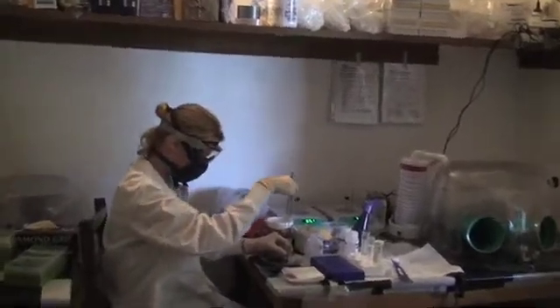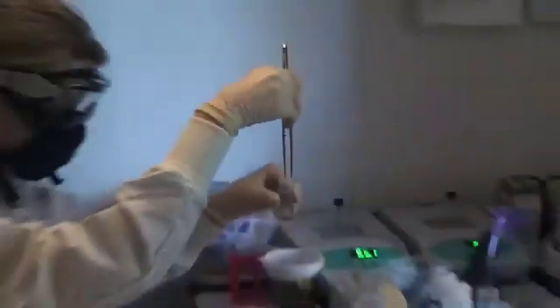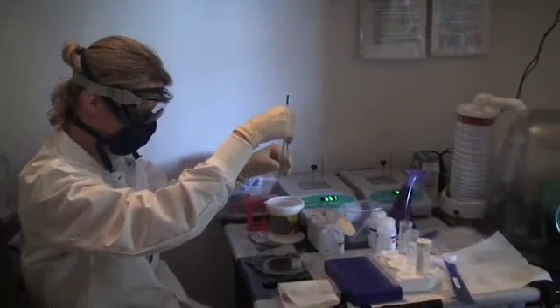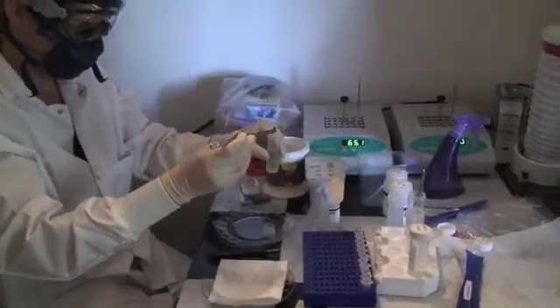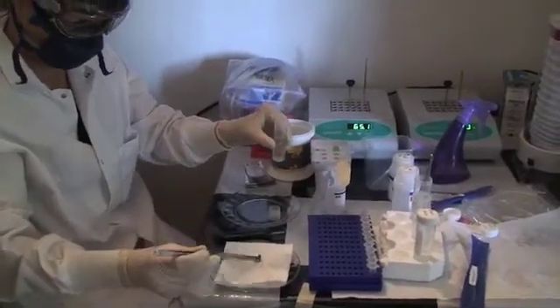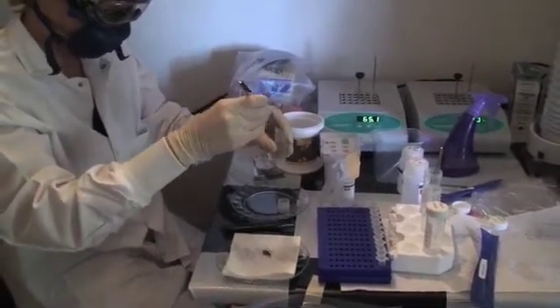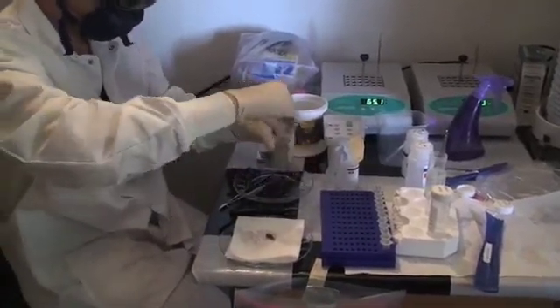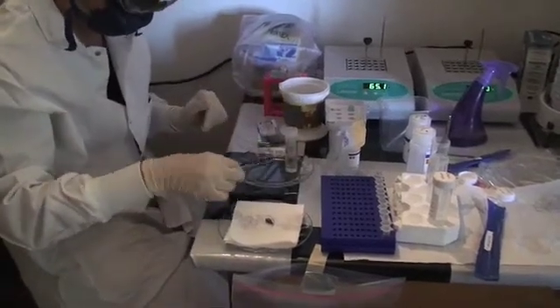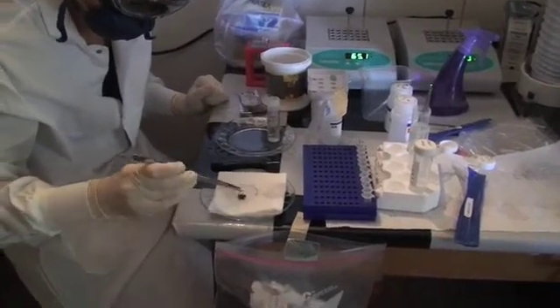Heidi is getting ready to go in. The actual bushmeat sample is confiscated bushmeat, possibly civet. Heidi is removing the sample. We bought some glass plates at the local market so that we can clean them between samples. The sample was collected a little over a week ago and put into ethanol. These were all fresh samples, not smoked, so we're doing a test case on the easier scenario.